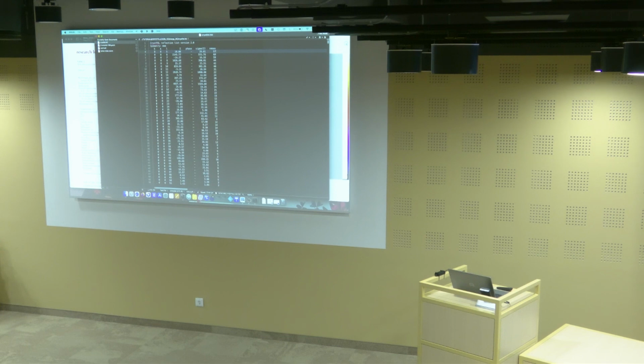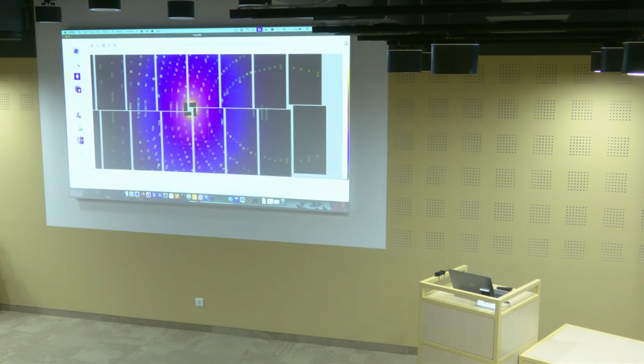The next step would be to calculate your figure of merit, so your statistics, like is the data set good or not. Explaining all these parameters will also take quite some time, so we'll not do that, but we're just going to export the data into something that we can use.